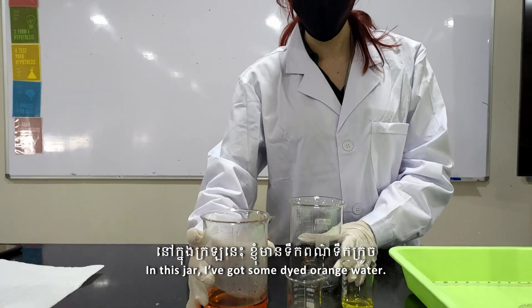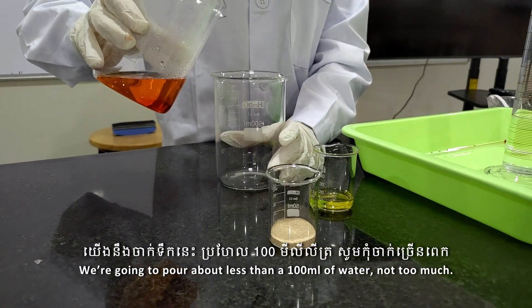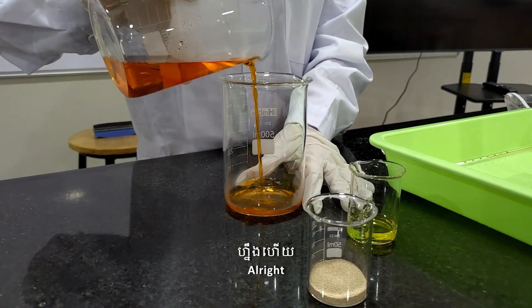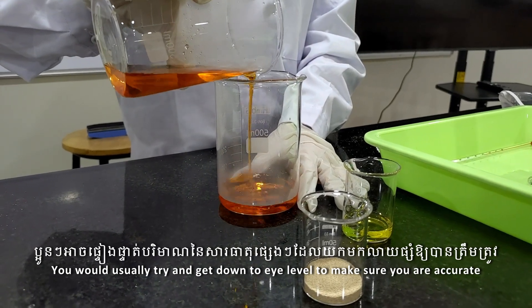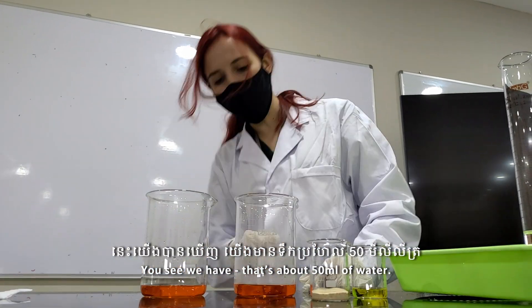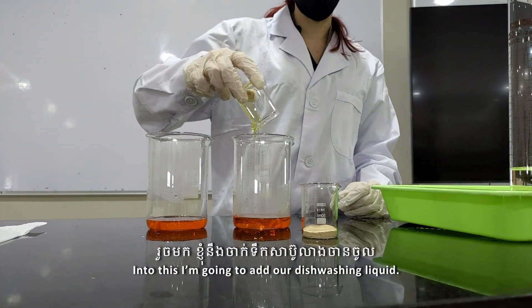In this jar I've got some dyed orange water. We're going to pour about less than 100 ml of water — not too much. You would usually try to get down to eye level to make sure you are accurate. That's about 50 ml of water.